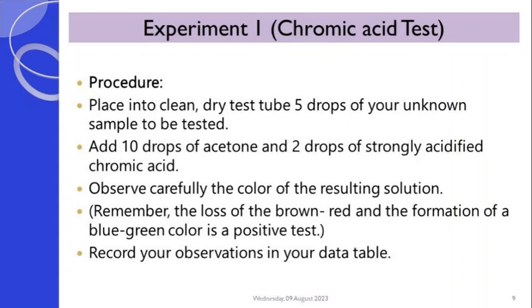When you are done, you add about 10 drops of acetone and 2 drops of acidified chromic acid. Wait and observe carefully whether there will be any color change.